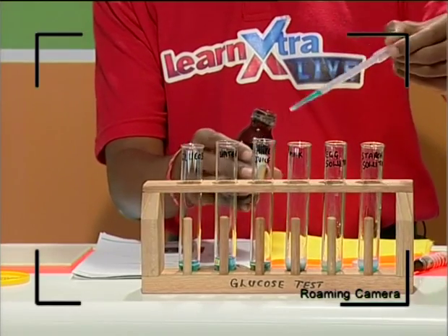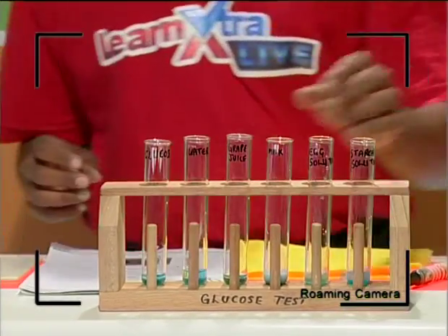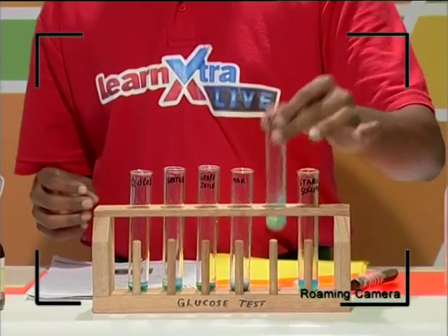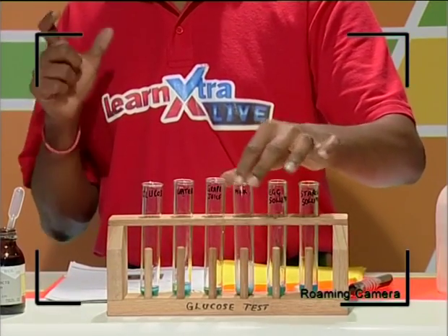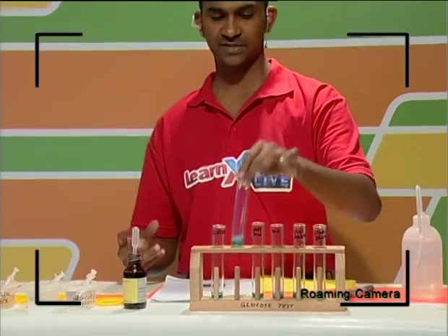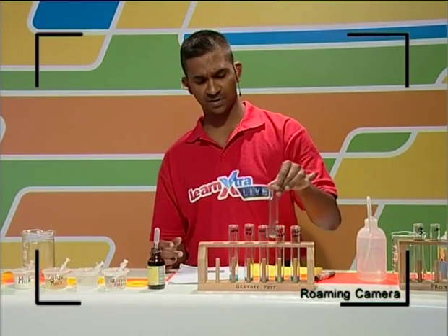I hope that nothing's going to blow up today, but I doubt it, because we're using all organic compounds and we're not using anything that's combustible yet, until we get to ether. So we're going to give this a gentle stir, and we're going to look out for a color change. Now, the color indicator when using Benedict's reagent, guys, is a dark orange-red precipitate that will develop at the bottom of the test tube, and that would indicate a positive change.